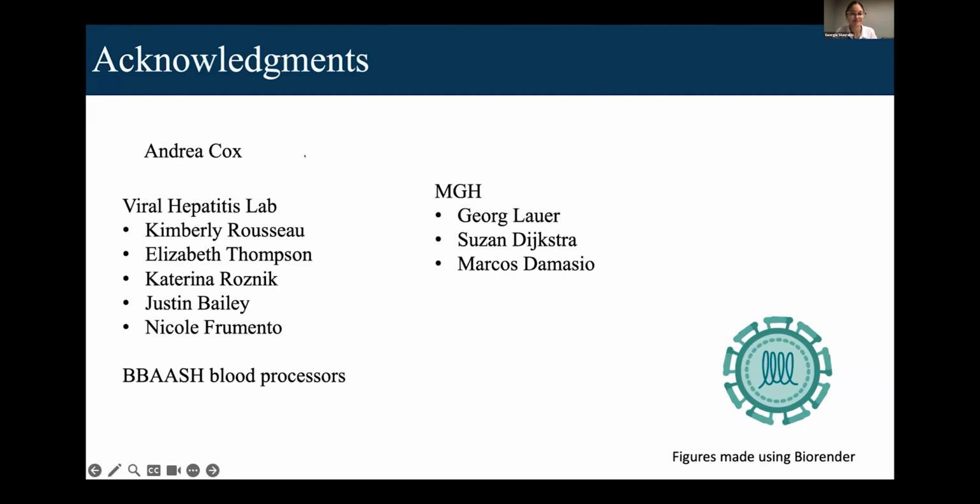Thanks, Georgia. I have a quick question just about the overall principle, because obviously the biotinylated pentamers are one option for tagging any color that you like onto this, and then there's also the unlabeled pentamer option, which you can use in the first place to then put these different colors on. So I'm trying to understand the overall objective when you pre-conjugate the biotinylated pentamers.